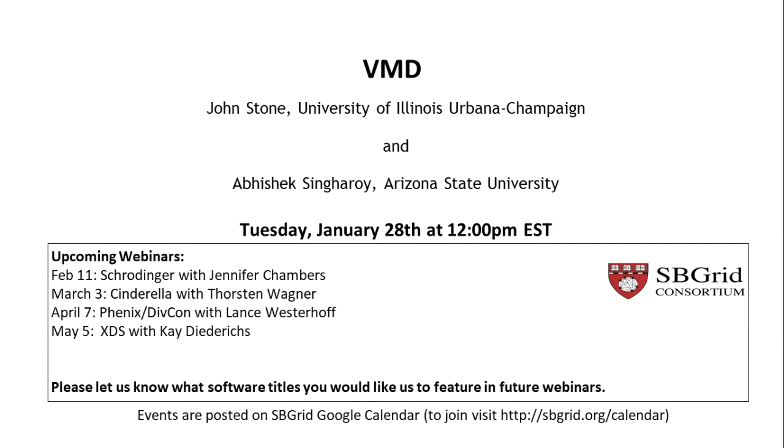We use parallel algorithms on multiple GPUs, and we can do things like a correlation field for all the different things that are in one of these tomograms, and have the computer do most of the legwork. And that would relieve the experimentalist from having to manually drive user interfaces to pick all these little things and do individual cross correlations the hard way.